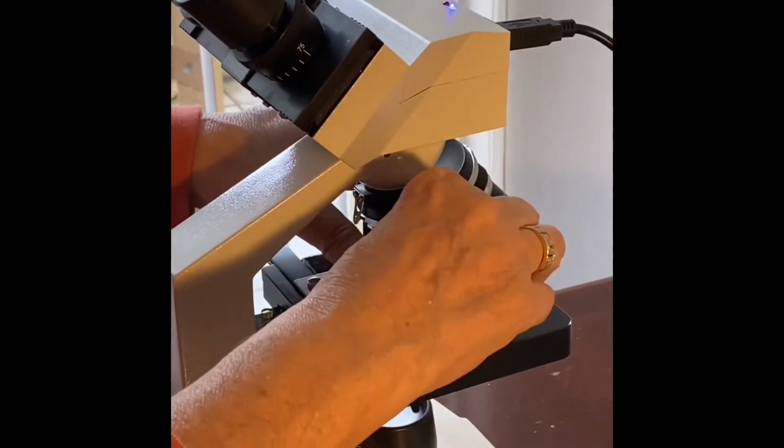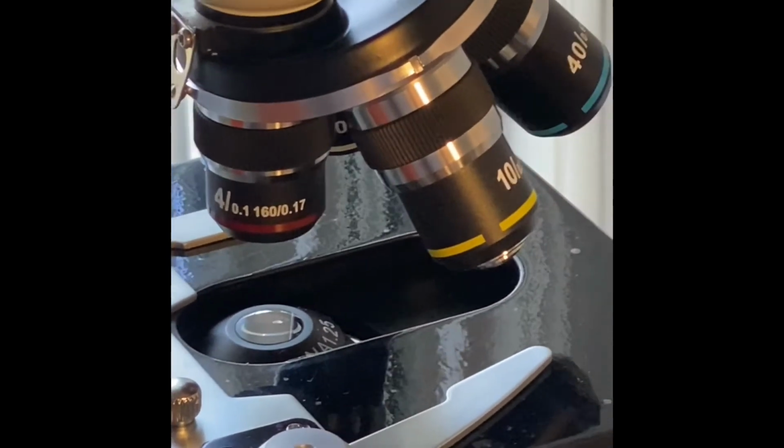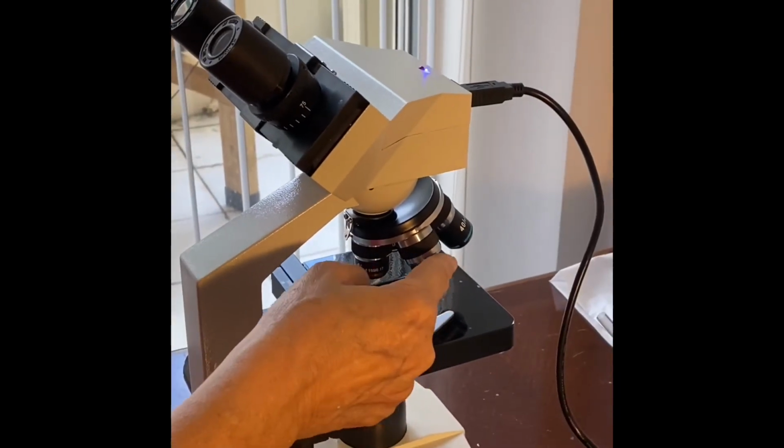You can see there are different lenses in your microscope. The two different lenses are ocular lenses and objective lenses.